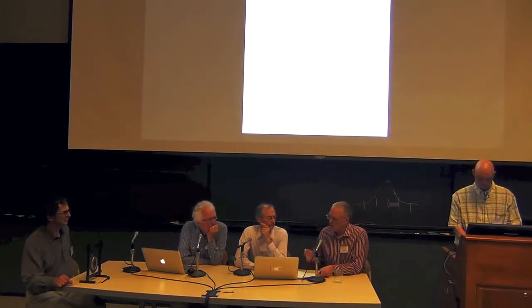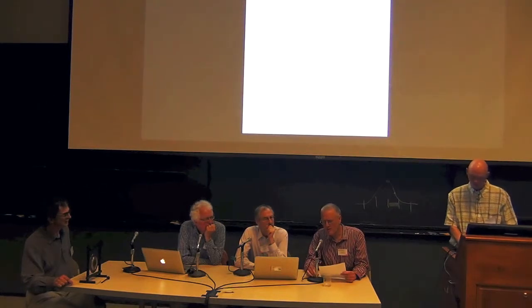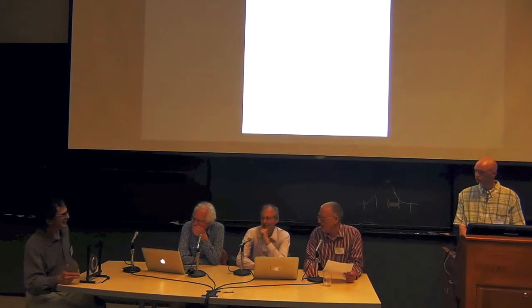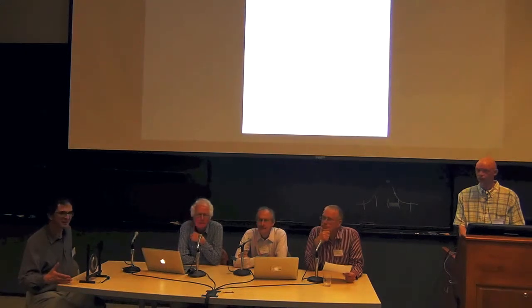So, yeah, that's a good point, but I think what interests most people, also if I look at CCP4 bulletin board discussions, is what is the resolution of your data? No, but this is the answer. Yeah, okay, but I don't see any formula or any easy way. Because this is an effective informative resolution in a sense. This is a resolution where experimental data are more accurate than model error. So you set 1.4. It's a bit lower than the limit of your data.